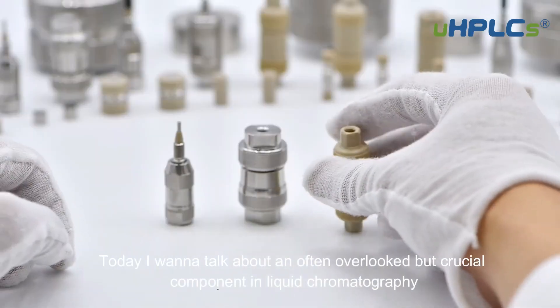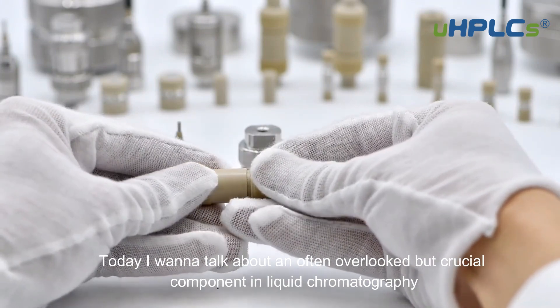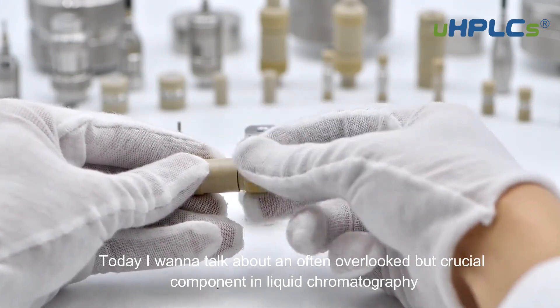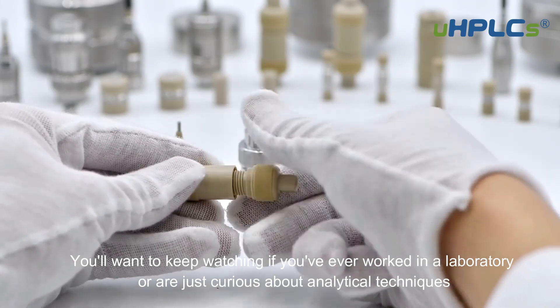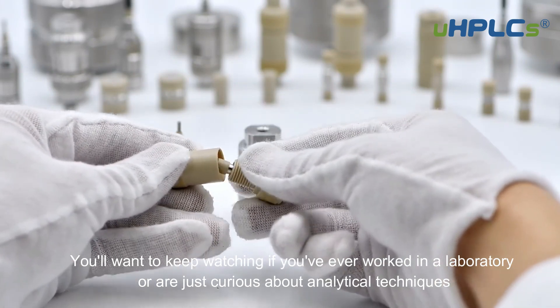Hi everyone, today I want to talk about an often overlooked but crucial component in liquid chromatography: the guard column. You'll want to keep watching if you've ever worked in a laboratory or are just curious about analytical techniques.